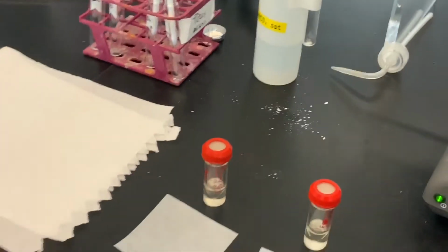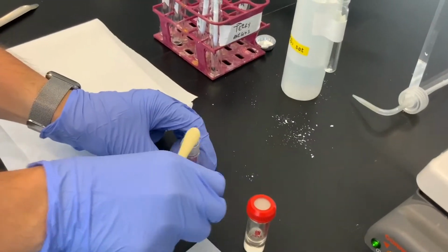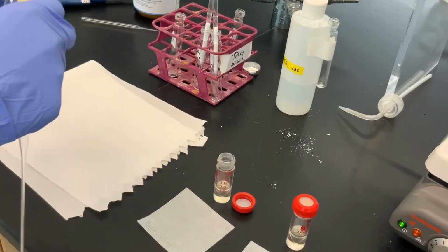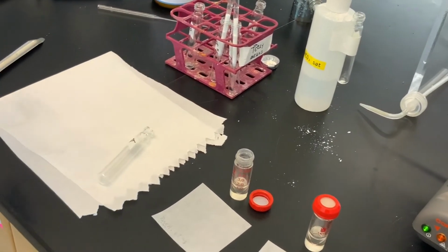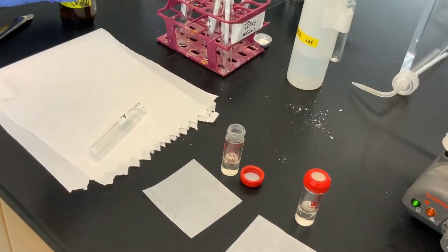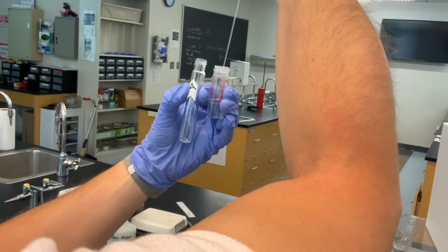So now we're going to very carefully transfer the organic layer from part A. So if you're ambidextrous enough, you can do this.